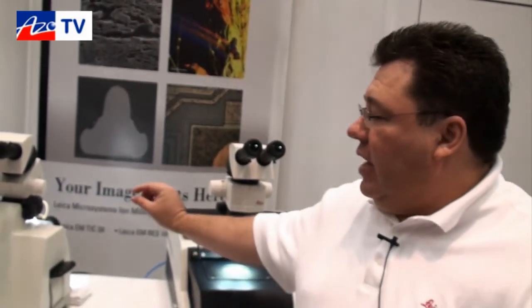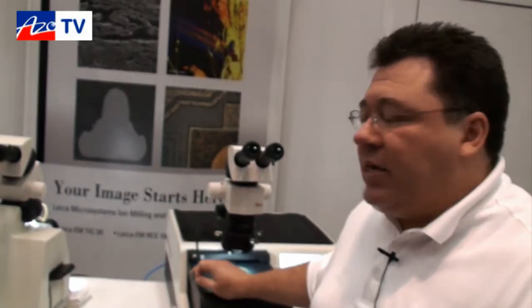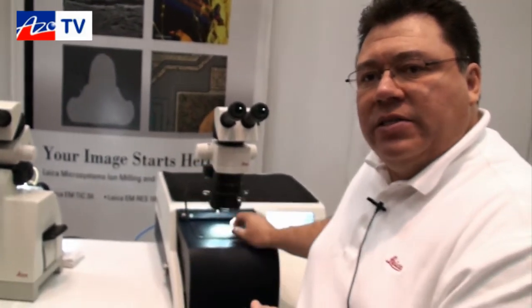Here, again, it's all done in one system — very fast, very efficient. And the nice thing is if you are going into the TIC 3X, we have chucks available that basically let you take out the sample, put it into the TIC, and it's already set up properly. With regards to the TIC 3X, what's the reason for having three ion beams? It gives a faster process versus a one or two beam system, as well as a wider sample surface when you're done. There's also no need for oscillation, which gives better heat transfer on the sample.